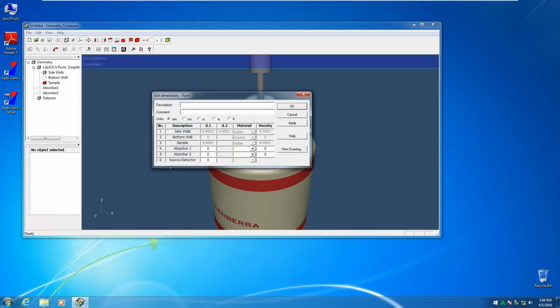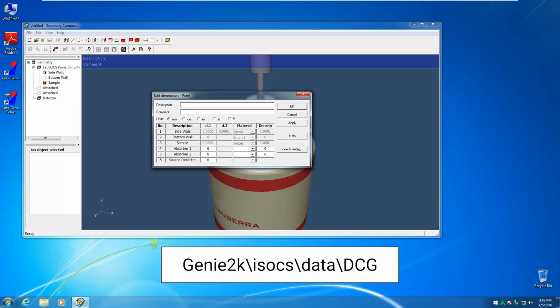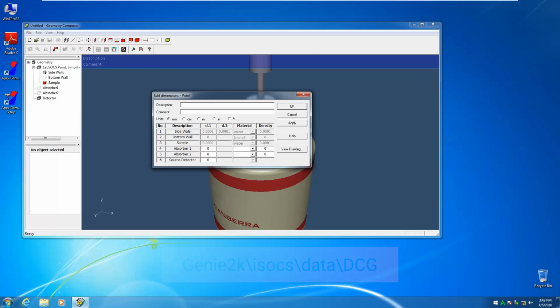We will continue by highlighting the 10541 detector designation, and then clicking on the OK action button to display the Edit Dimensions dialog window. At this point, we would normally complete the process of creating a new geometry file, saving that file, and generating a set of efficiency data points that are stored as a new .ecc file. Successful completion of those steps would confirm that the new 10541.par file was copied to the desired folder location and is properly linked to the 10541 detector parameters within the modified detector.txt file. However, those additional confirmatory steps will not be demonstrated here.